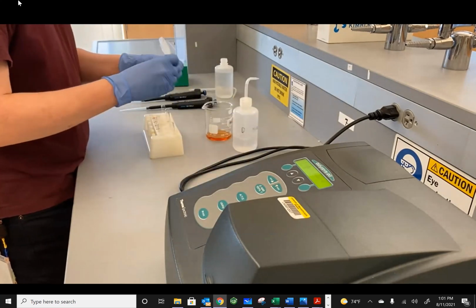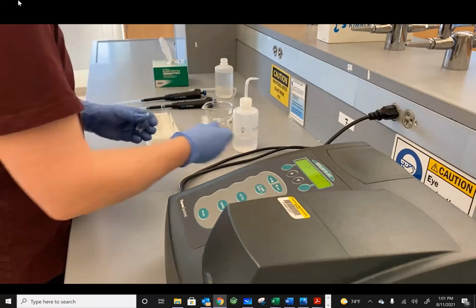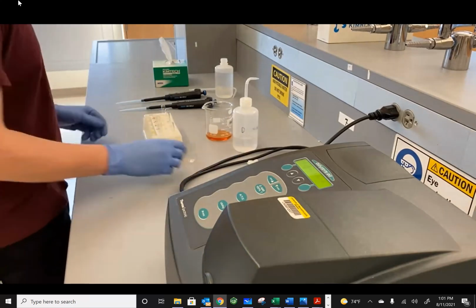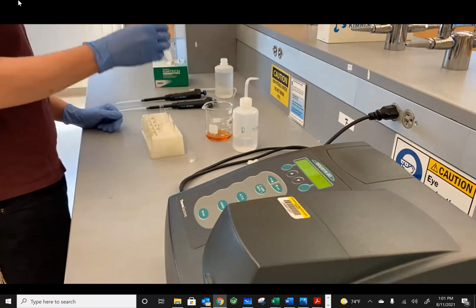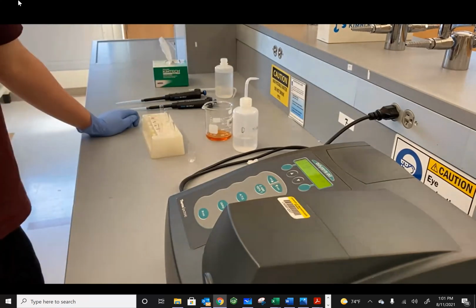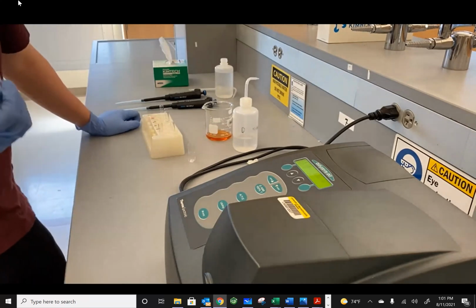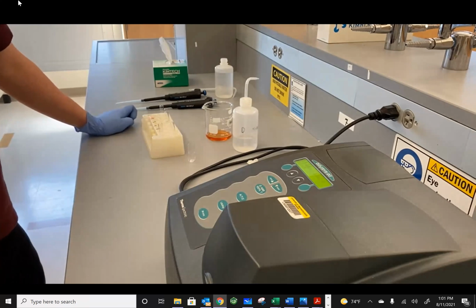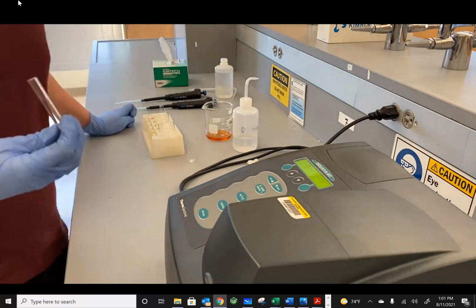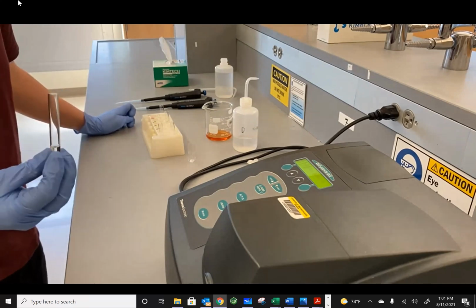Make sure it is, if not completely dry, then at least mostly dry, so it doesn't affect your concentration of your next trial. So the next trial consists of creating 4 different test tubes that will vary in the concentrations of the ligand species in each test tube. Now, the reason for this is so we can study how the chemical equation and the stoichiometry affects changing concentrations.